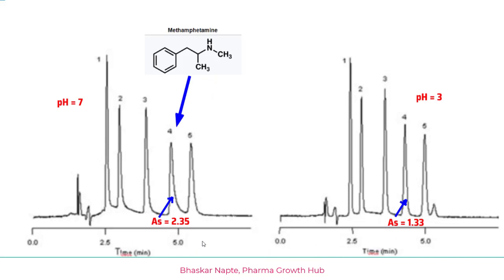Let us see this with a simple example shown on screen. There are five different peaks in the chromatogram. On the left side, the mobile phase pH equals 7, and the asymmetry or tailing of peak number four — methamphetamine — is 2.35. Now changing the pH from 7 to 3, on the right side of the chromatogram, the tailing of the same peak has reduced to 1.33. This reduction is clearly because of the suppression of silanol ionization at acidic pH.